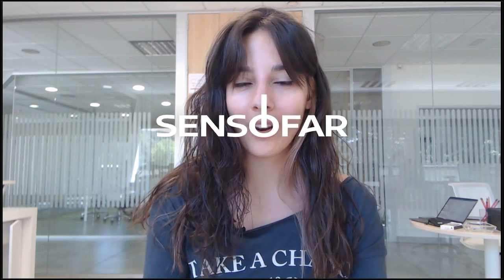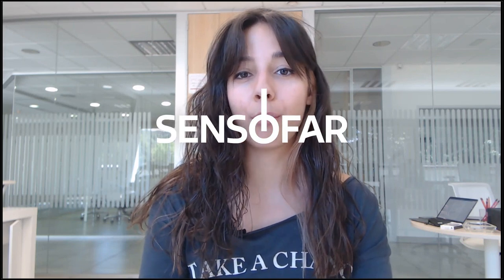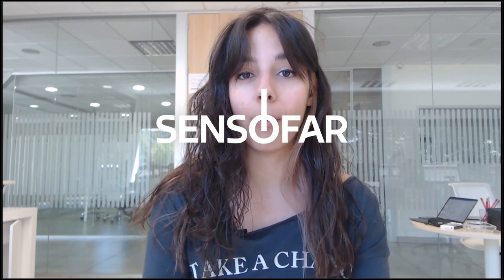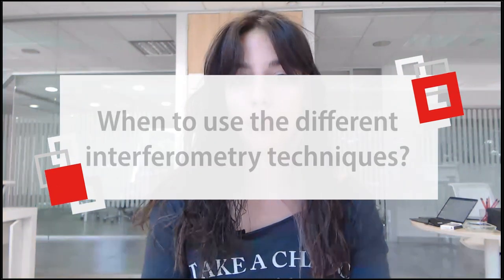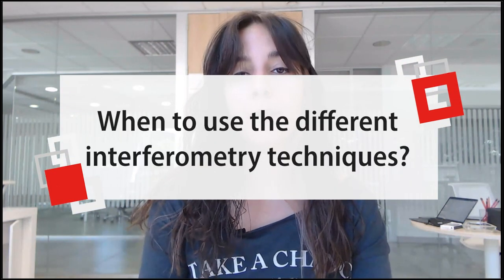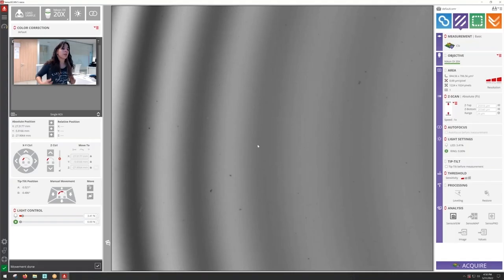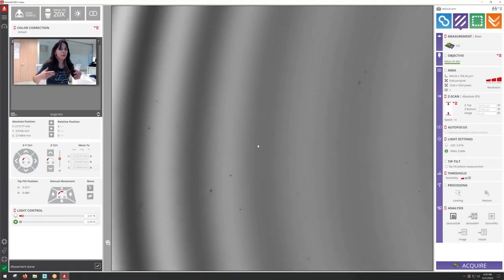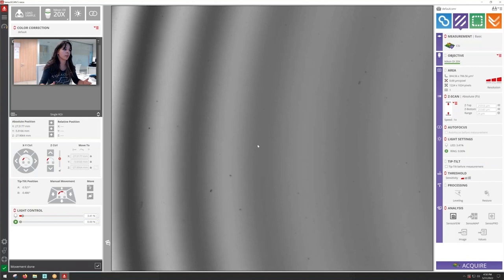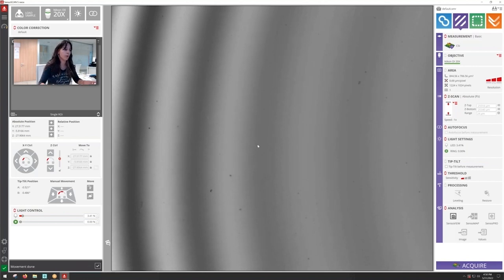Hello all and welcome to this brief tutorial about when to use each of the modes of interferometry: PSI, EPSI, that has a new algorithm in this new 7.7 version of SensoSCAN, and CSI. So let's get started. This video will consist of different samples, different examples in which we can apply the different modes of interferometry.